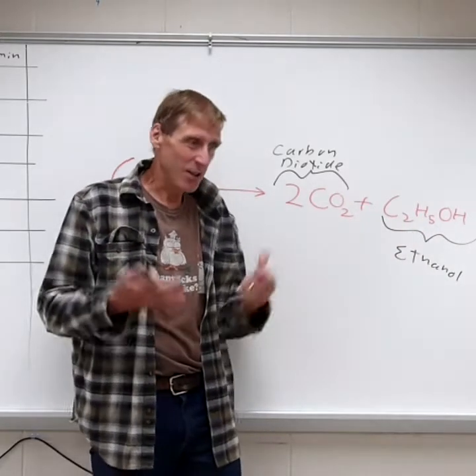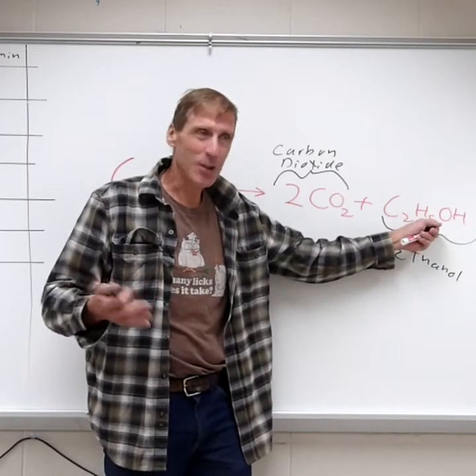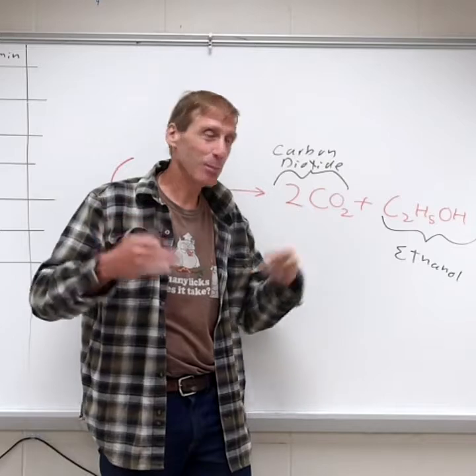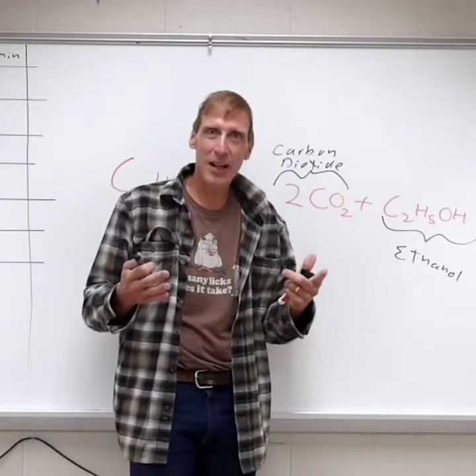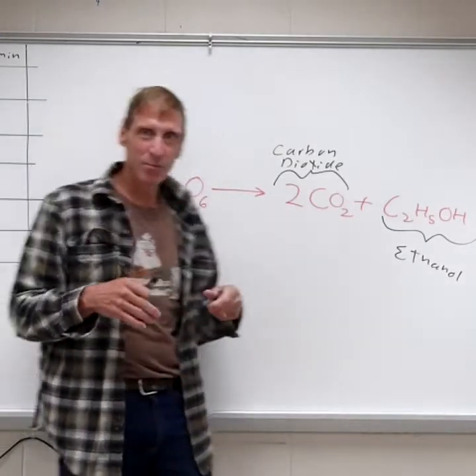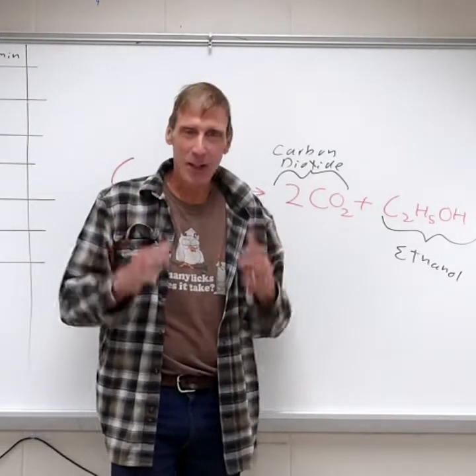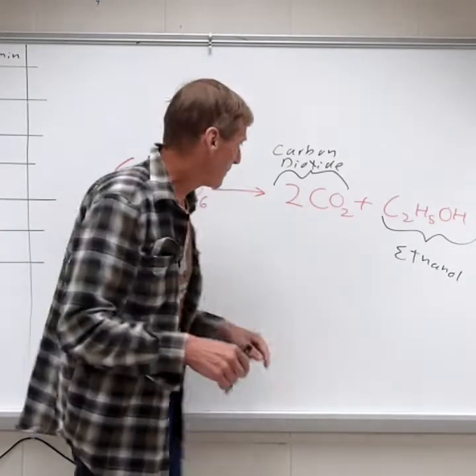So these yeast are eating all the sugar, and they're more or less swimming around in their own waste material, this ethanol. When it builds up to a certain point, it'll kill them. That's why things like beer and wine typically aren't much over 12% ethanol. You put yeast in a container with some kind of carbohydrate, sugar, whatever source, and you can only get to about 12% or so ethanol, then the yeast die, that's all you got.